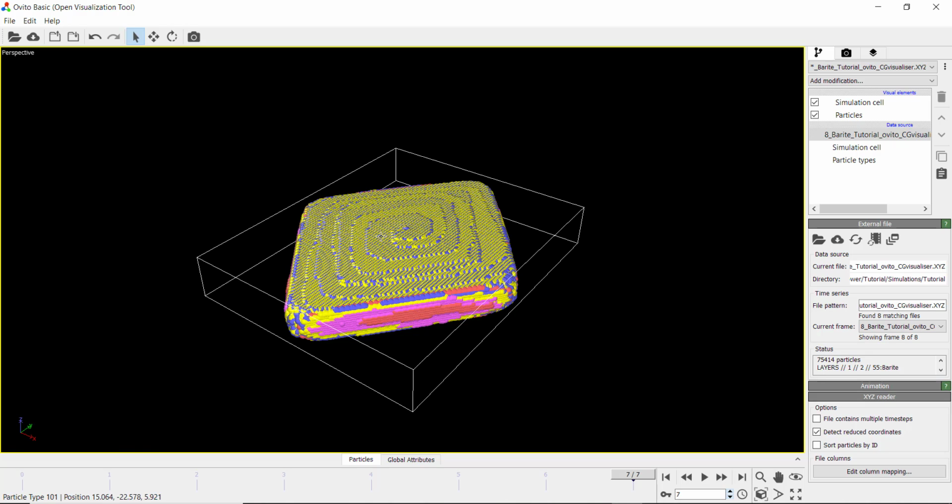So we've covered a few additional features here that can be added to tile and net-based structures. So screw dislocations can be added to both types, supersaturation excess can be added to both types, and poisoning can be added to both types. But there are a few features that only apply to net-based structures, and I'll just run through them both now.